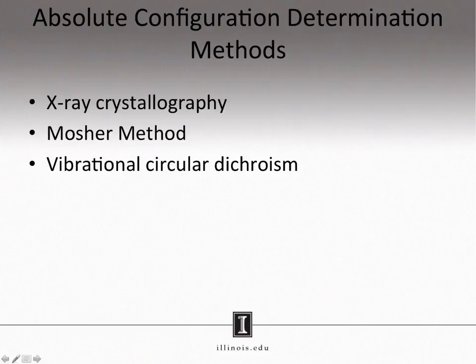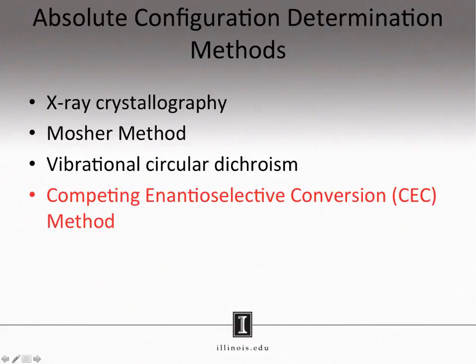The technique you will be using is what is called the Competing Enantioselective Conversion, or CEC for short, method. The CEC method, as you will see, is quite simple to execute and to analyze.